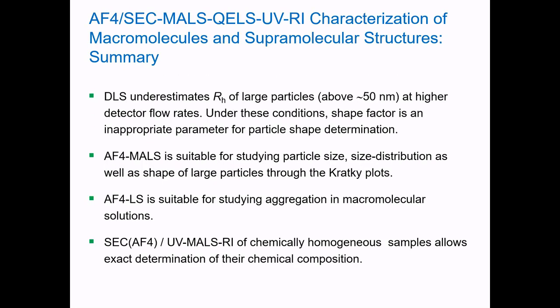Overall, the message of this webinar is that the dynamic light scattering detector underestimates the hydrodynamic radius of large particles at higher detector flow rates. In such cases, the shape factor is an inappropriate parameter for determination of particle shape. AF4 coupled solely to a multi-angle light scattering detector is suitable for studying particle size distribution, as well as the shape of large enough particles if static light scattering data are presented in the form of Kratky plots.